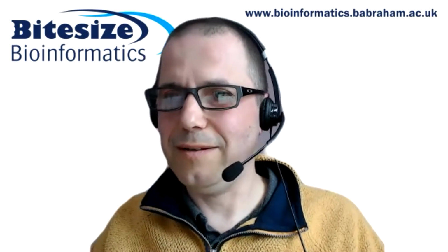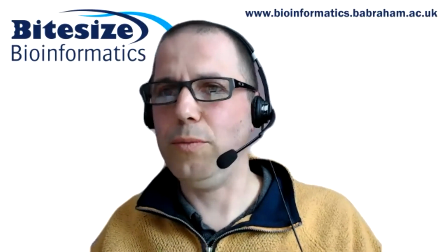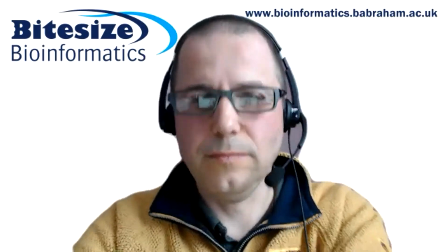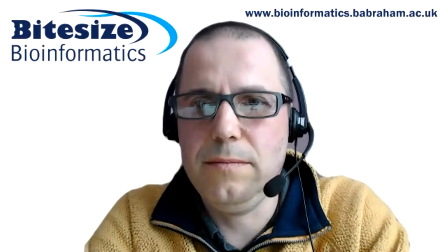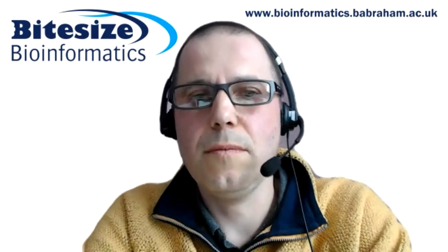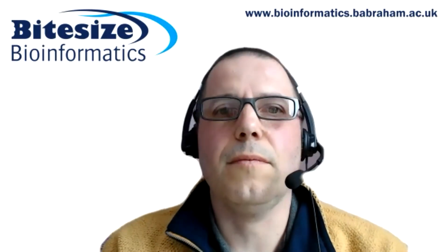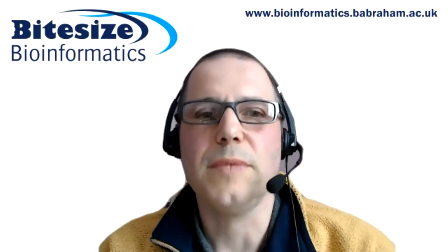Hello, Corinne. I was wondering, so you can save all the plots that you make and all the data tables into your Vistory, but you'll still also save those separately to be able to import them, for example, in other analysis programs, or to edit the figures, or can you export that from the Vistory as well?